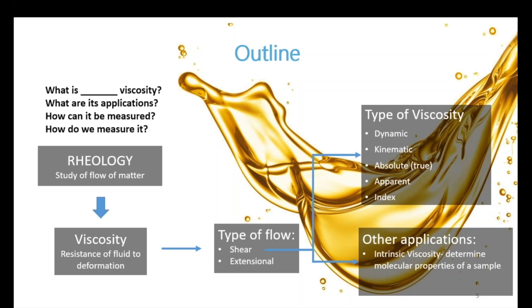And then as a side application, we're going to look at intrinsic viscosity, which is related to shear viscosity, but it's a property on its own. And we're going to be covering questions such as, what is X viscosity? What are the applications for this type of viscosity? How can it be measured? And how do we measure it at RheoSense? So without further delay, I'm going to start with shear viscosity.